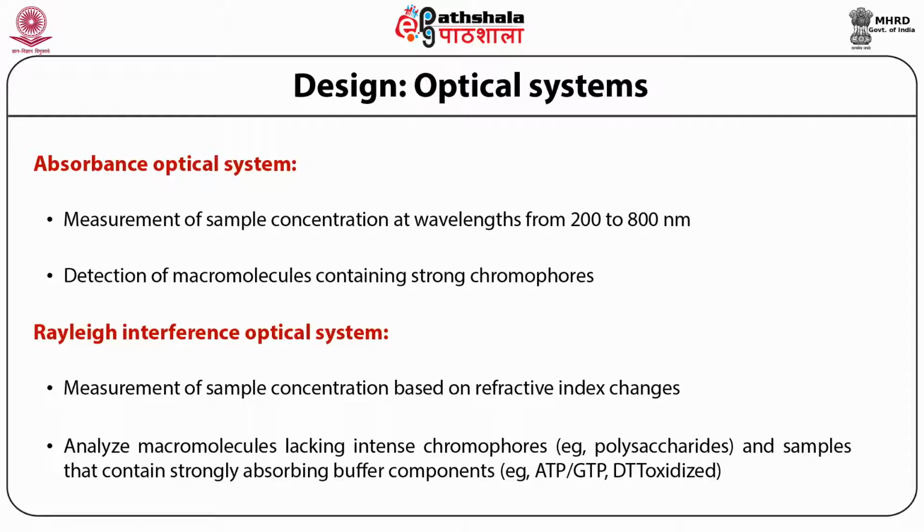A uniformly dispersed sample solution is placed in the cell and a sufficiently high angular velocity is applied to cause rapid sedimentation of solute towards the cell bottom. As a result, there is a depletion of solute near the meniscus, causing the characteristic spectrum-like figure you can see here, and it reaches the plateau. A sharp boundary occurs between the depleted region and the sedimenting solute, as you can see here in the plateau formation once you plot the radius versus the absorbance.